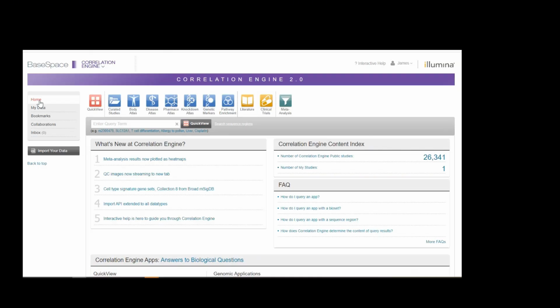Users love Correlation Engine for the tremendous amount of expert-curated, omic-scale data that it lays out in a biologist-friendly user interface. Multi-omics data that is continuously added to the system and can be combined with your private data. Translational researchers use the push-button applications to extend their line of sight by generating and validating novel hypotheses.